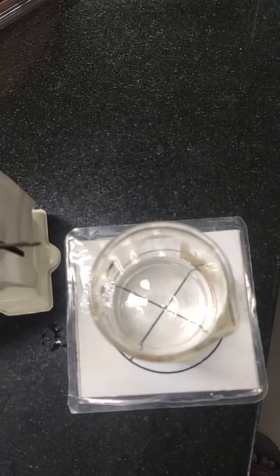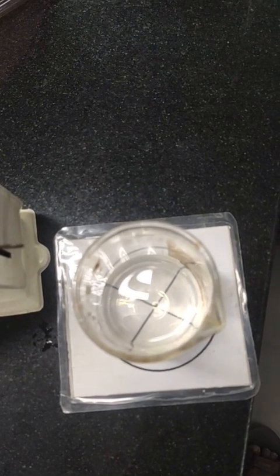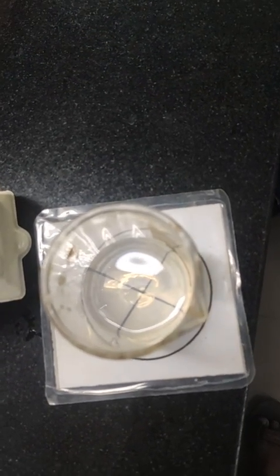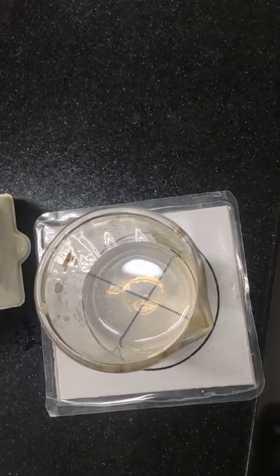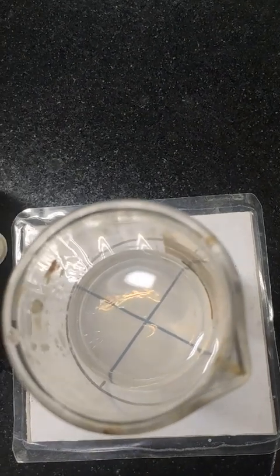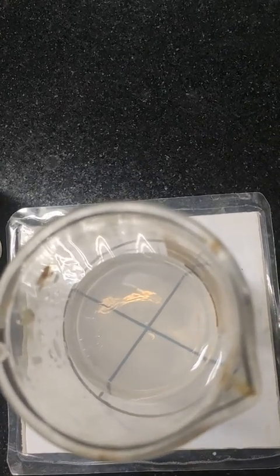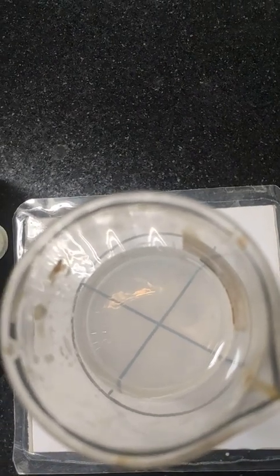We will see from the top of this container the cross mark which was made by pen will become faint due to formation of colloidal sulfur in the container. The solution will start becoming turbid, and with increase in turbidity of the solution the mark will become invisible. The moment that mark disappears, we will stop the stopwatch and we will record the time.